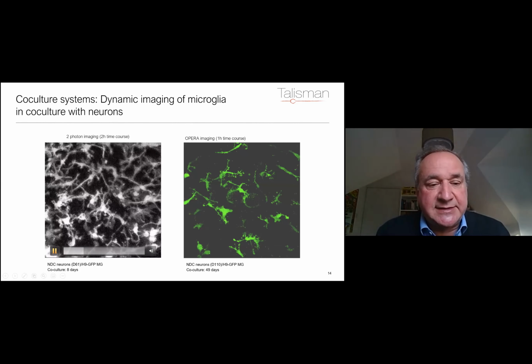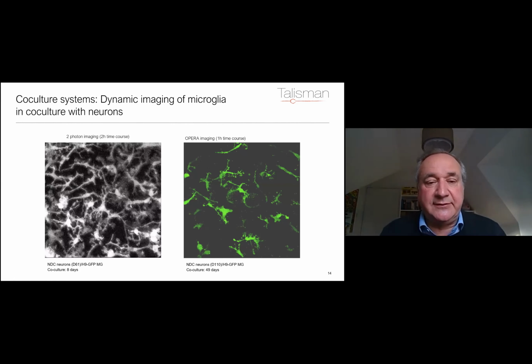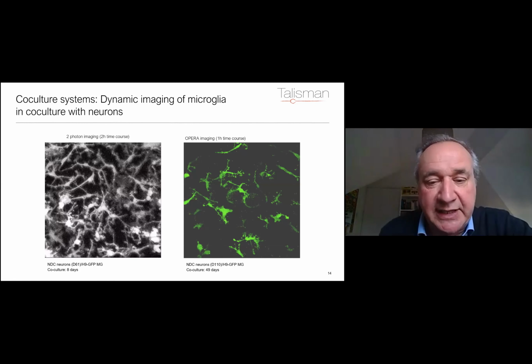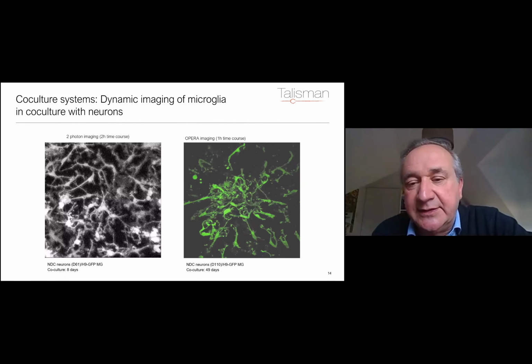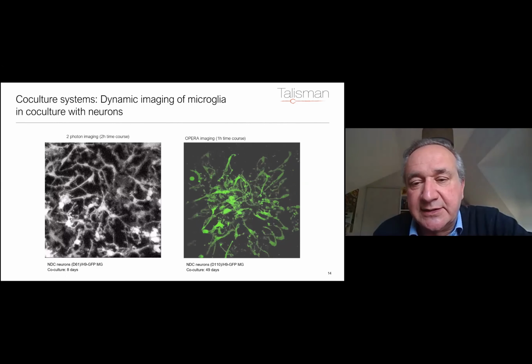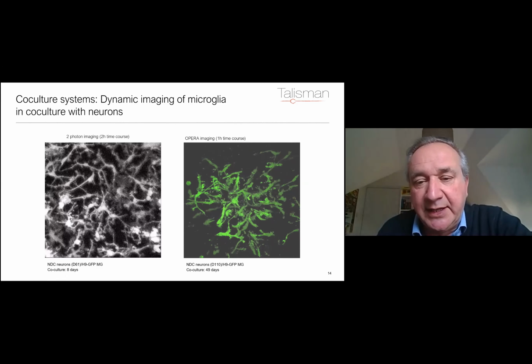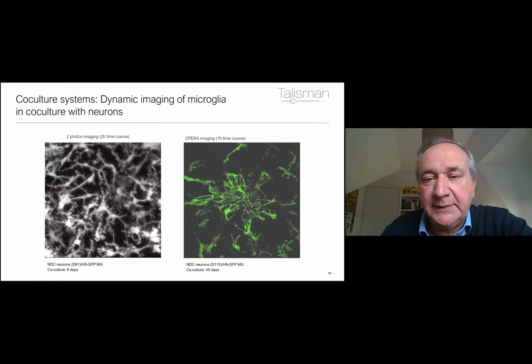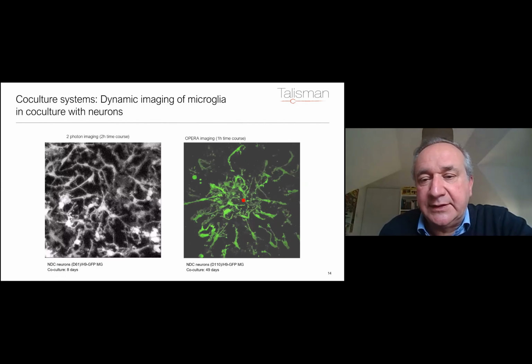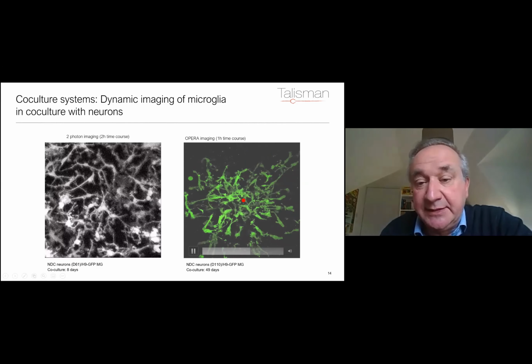So this is at 8 days. And you can see they're really quite activated here. You can see the filopodia going out there and reaching out into the environment. And if you go to 49 days here, you can see another video where they're really clustering in onto the site where the phagocytosis is going. So they're clustering into the site where they need to do what they do in the brain. But we've recreated this in vitro in a dish. And the red here is showing where the stimulus is, and that is what is attracting them in to that site.